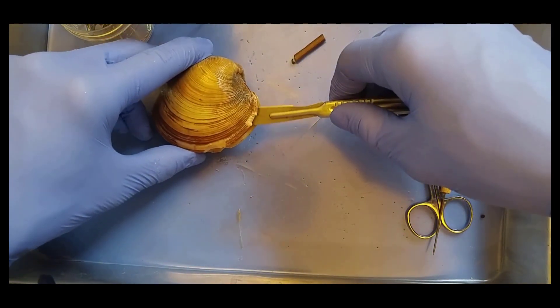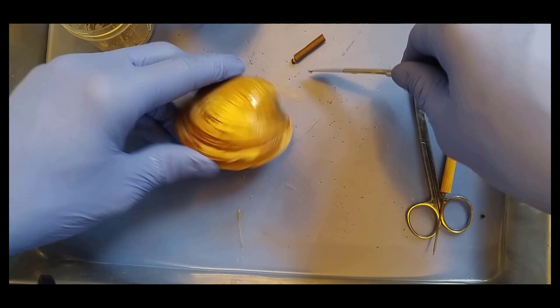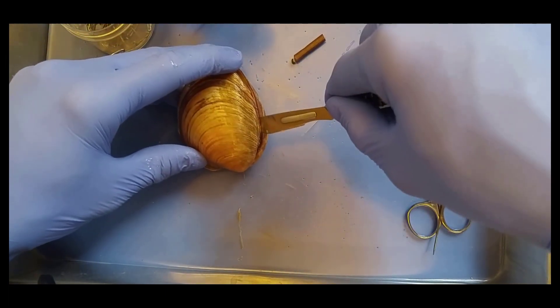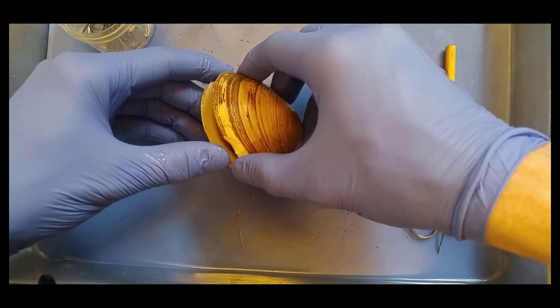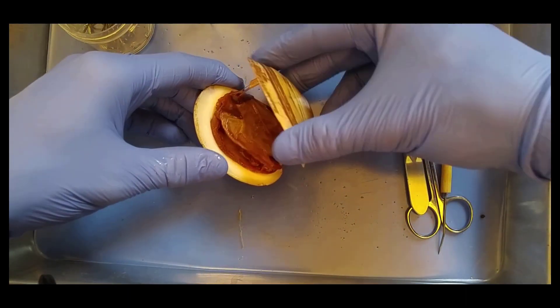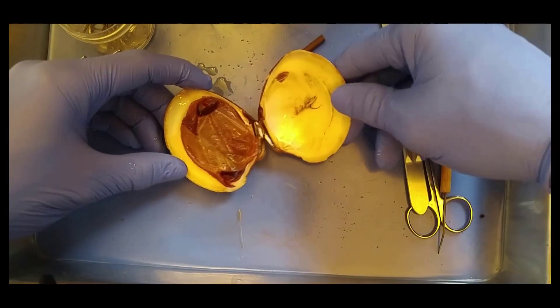So what we're going to do now is slice through those adductor muscles, just like this, and just like this on the other side. Charlie, please keep your hands away. And then we're going to slowly open, and what we have is an ooey gooey weird looking creature in here.